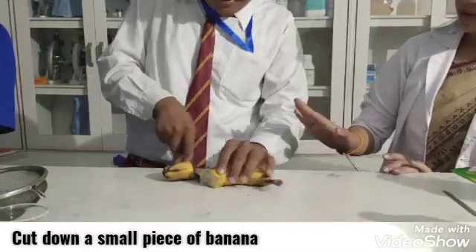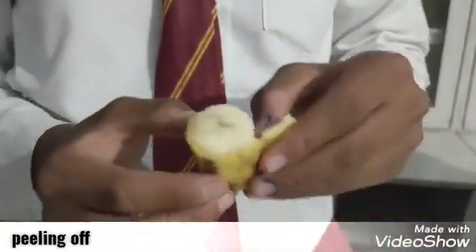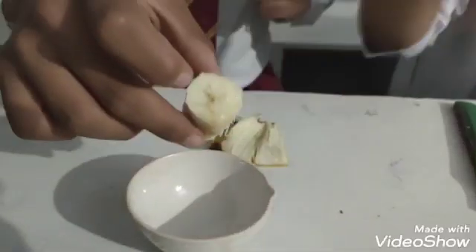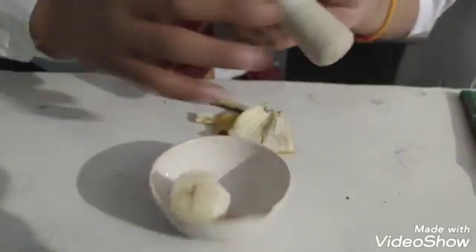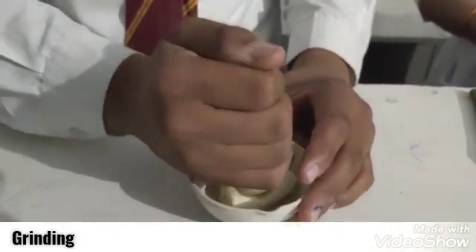Isolation of DNA from plant material. Take a small part of banana, peel it off, and put it for grinding. While grinding, make sure that there will be no lumps left.